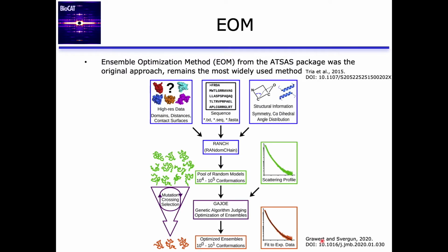The one I'm going to focus on in this talk is the Ensemble Optimization Method, EOM, from the ATSAS package. This was the original approach, published I think in 2007, and it remains the most widely used method. This is the most recent paper on it, so you should take a look at that if you use it. Generally speaking, the approach is relatively straightforward.